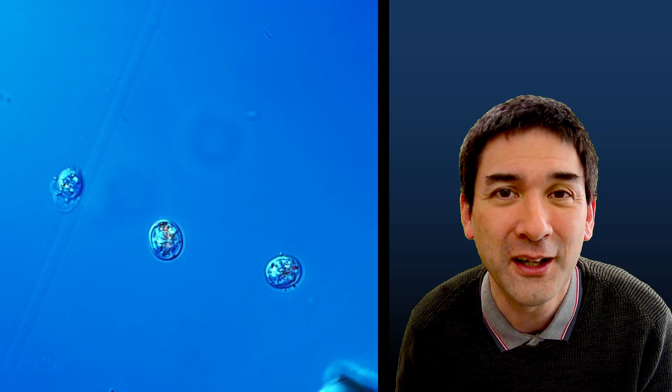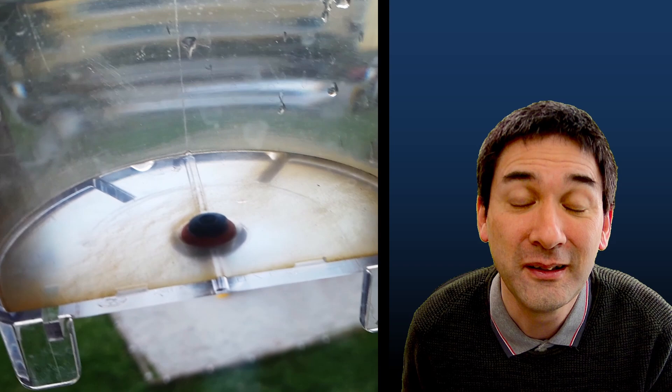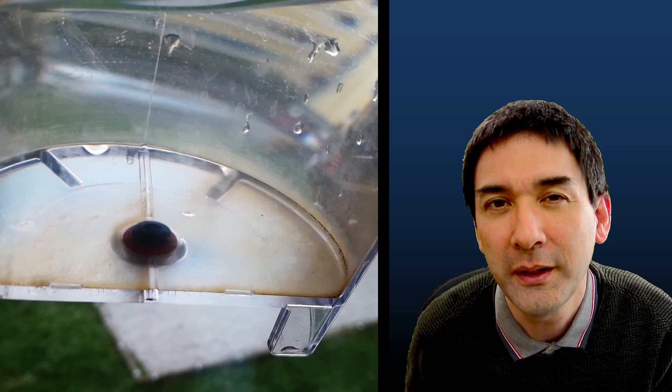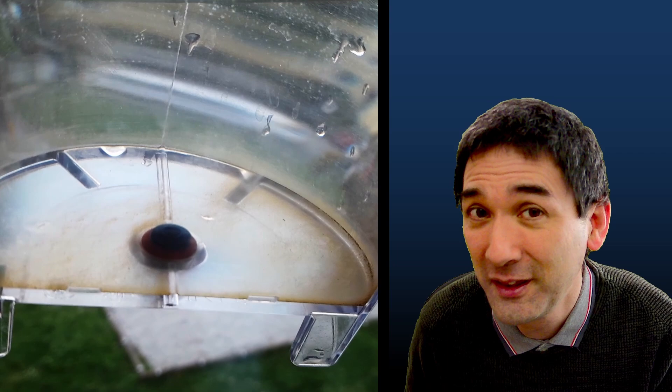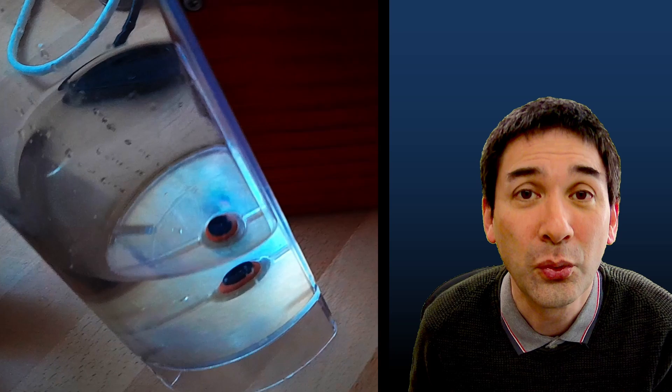But I think this little adventure has shown you that even in quite unexpected or maybe quite expected spaces, we can find microbes because as I told you before, where there is water, there is life and life will prevail. And I think we can expect quite a lot more microorganisms in all different places where there's plenty of standing water.